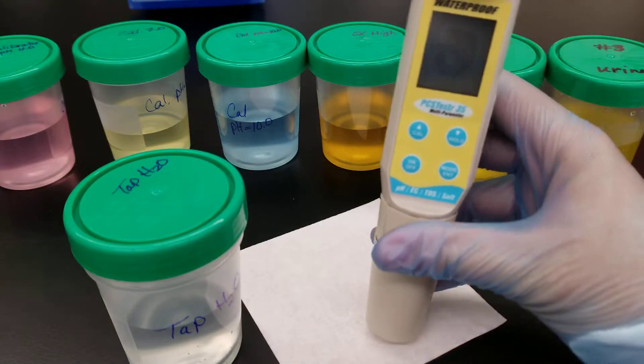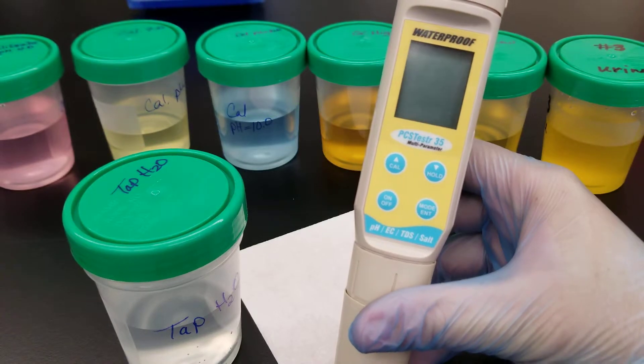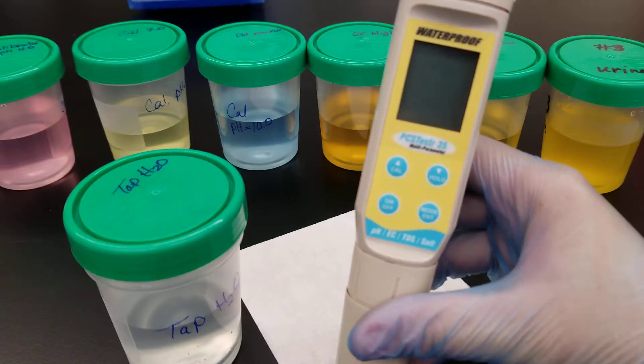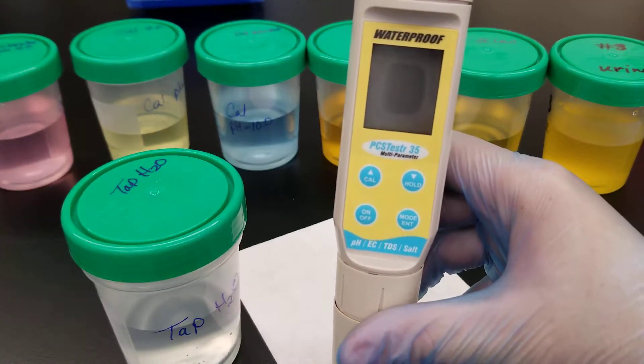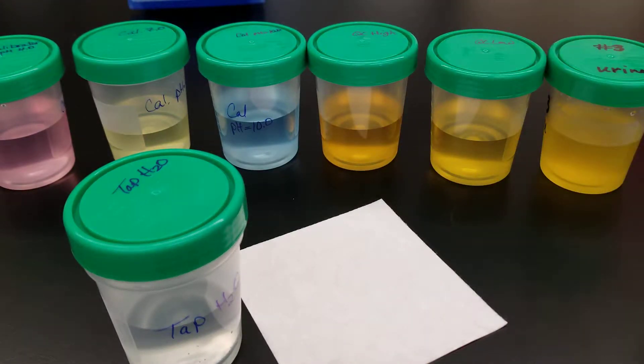Today we're going to be working with this handheld pH meter. pH is measured on body fluids in the clinical setting in order to find out if a patient has a certain condition. There are multiple types of body fluids, and each one would have its own pH, so a change in pH could indicate a disease state — and that's why this is done.